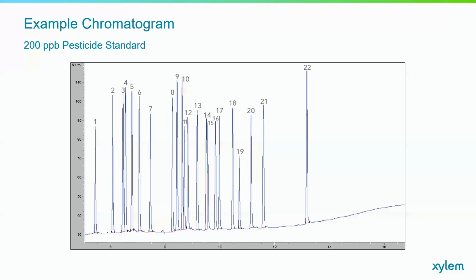And here's a similar situation for pesticides. We have organochlorine pesticides that are used in a variety of sample matrices: food, water, and soil. Toxic pesticide residues can persist in the environment. There are also polychlorinated biphenyls that were once used in transformer oils because of their desirable chemical and physical properties. These are another class of persistent compounds that are considered toxic. So EPA method 608, 608.1, 2, and 3, they have been available for many years and outline halogen-specific detection on a GC system for pesticides and PCBs.